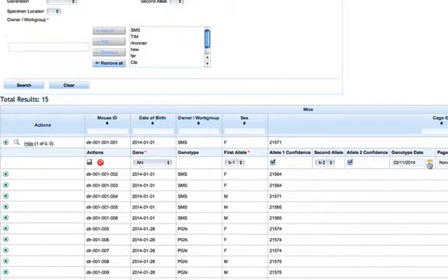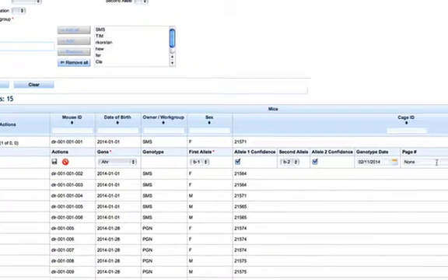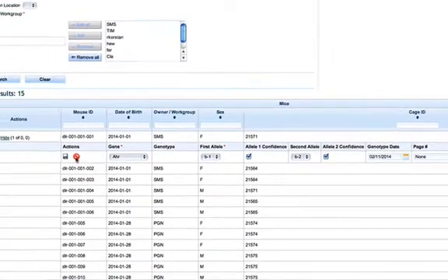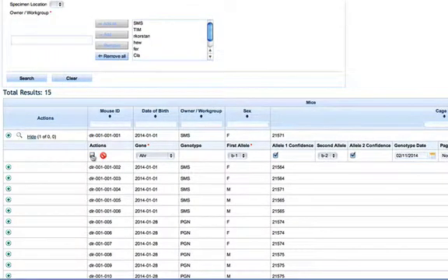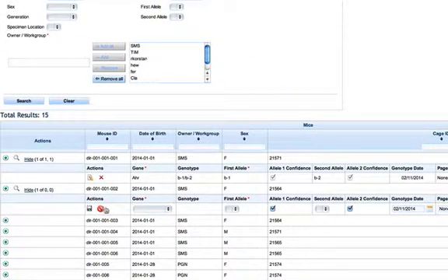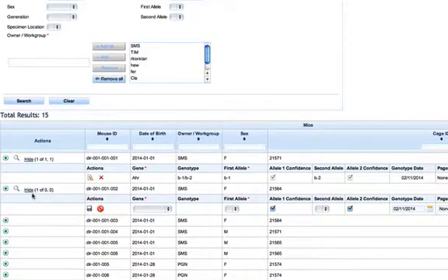You can change the date, page number, select a specimen location, add some comments, and then click save. You can go ahead and continue adding more genes to the mice.